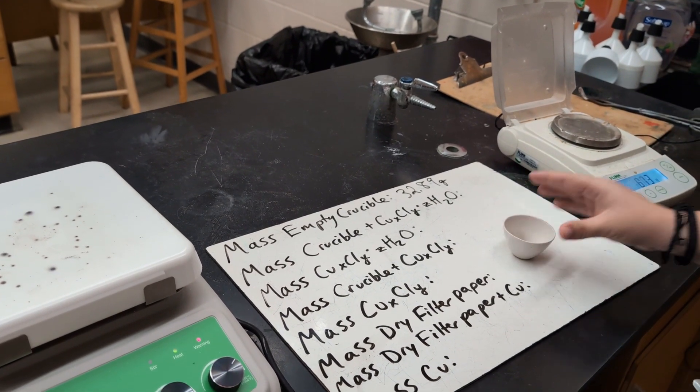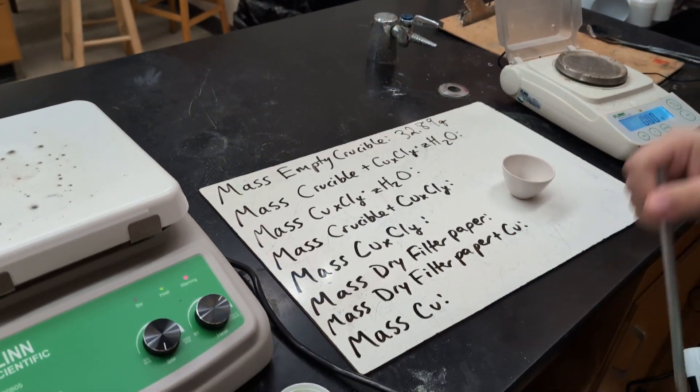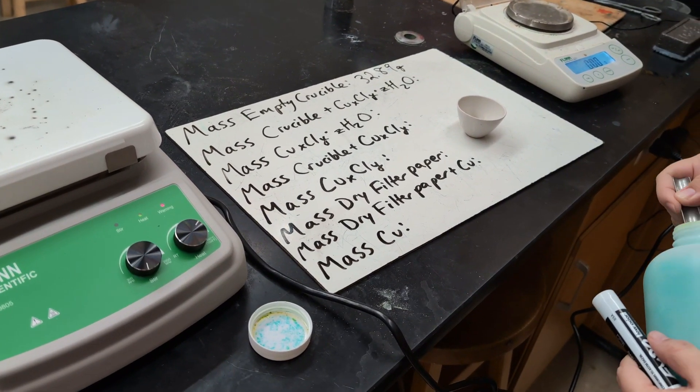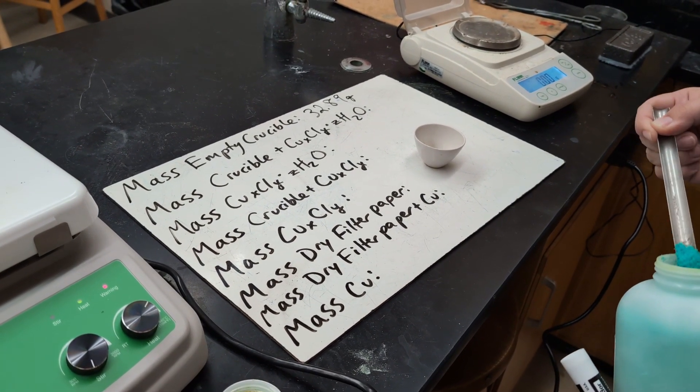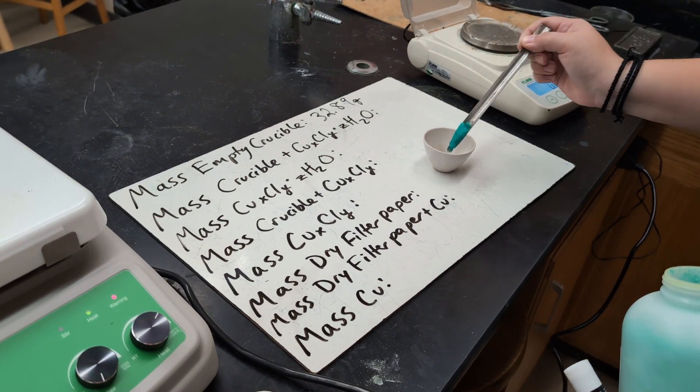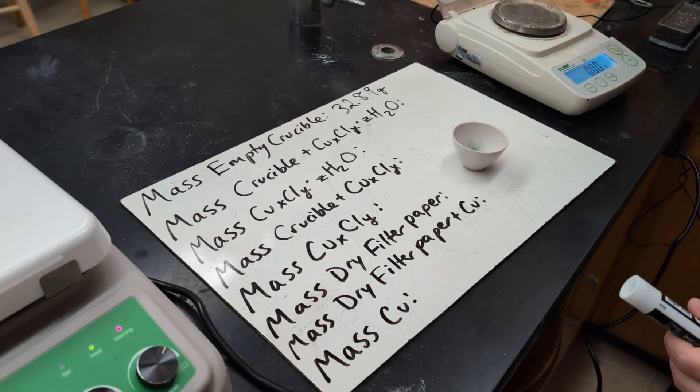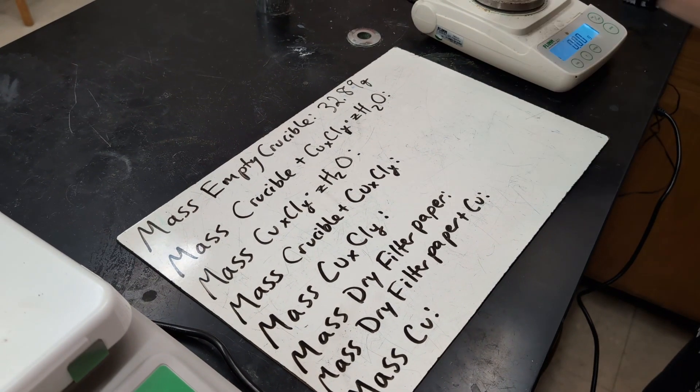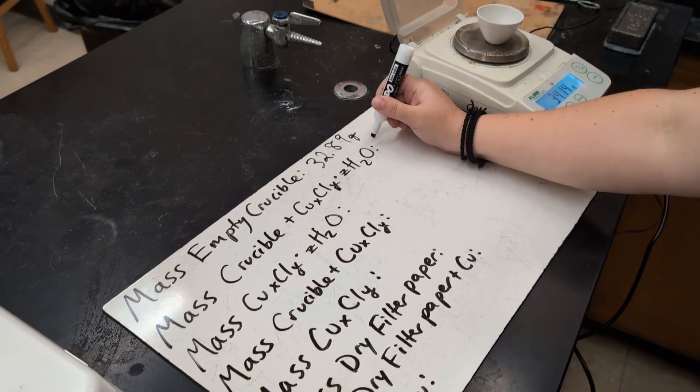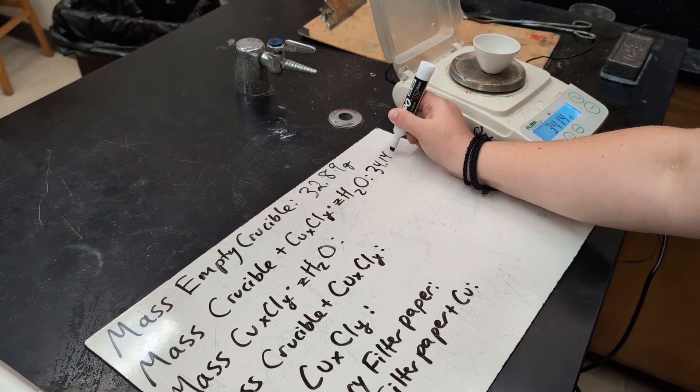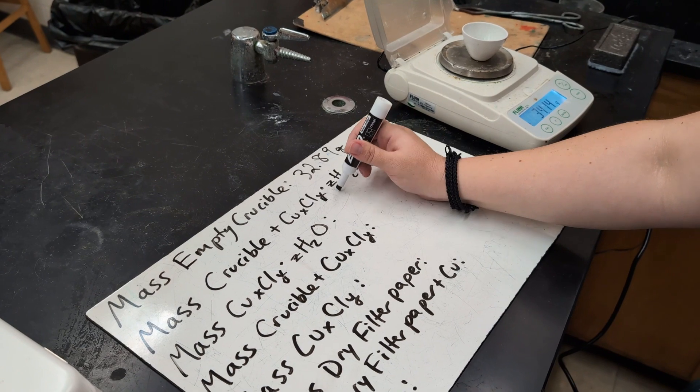And then I'm going to add a small amount of our hydrate. Now the copper chloride hydrate is this green or tealish color almost. And then we will record the mass again. And I have 34.14 grams of our hydrate. And again, it's a hydrate because it has that water present.